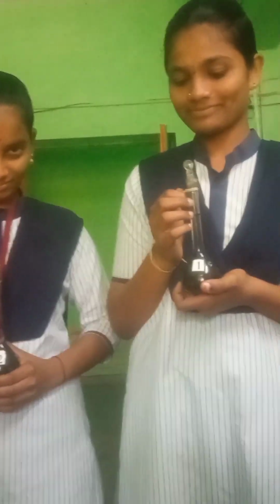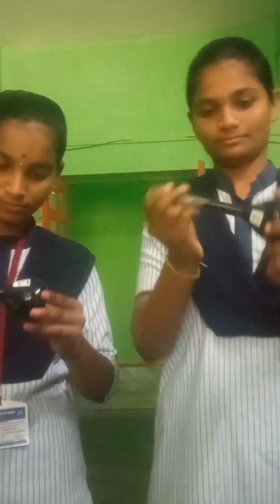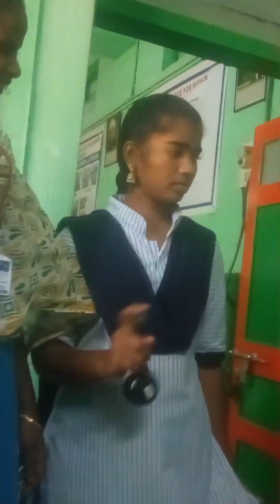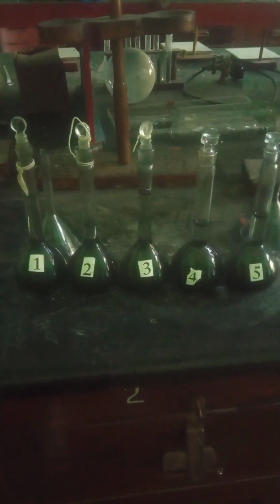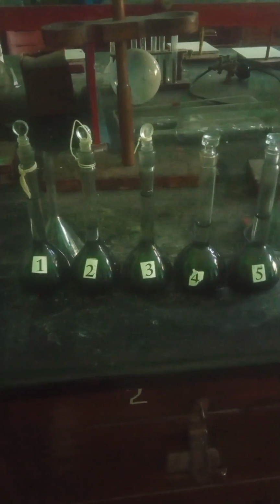Before that, the acetic acid is standardized by titrating with 0.1 M sodium hydroxide solution. The burette reading is considered as VI. Here VI means initial volume. So these are the flasks on stand.